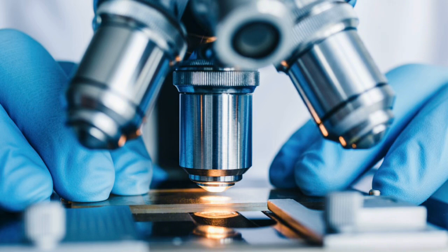In addition to magnification, microscopes allow scientists to make precise measurements. Using calibrated scales, investigators can measure the width of fibers, the diameter of a particle, or the space in between striation marks. These measurements can help determine whether two samples are consistent with one another. For example, in fiber analysis, the thickness and shape of a fiber can identify its source. In firearm analysis, microscopes measure tool marks, helping examiners determine whether bullets were fired from the same weapon. Accurate measurements strengthen forensic conclusions and support expert testimony in court.